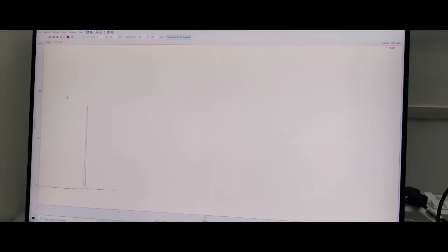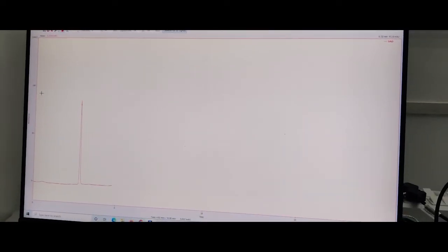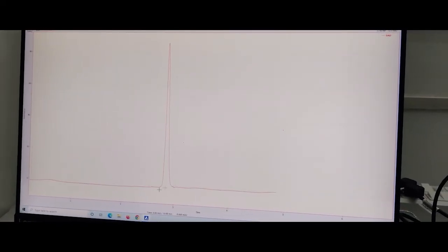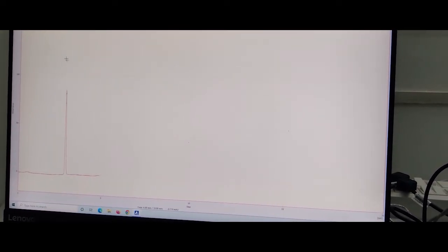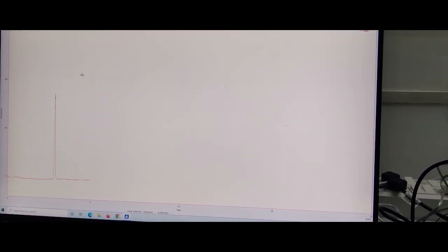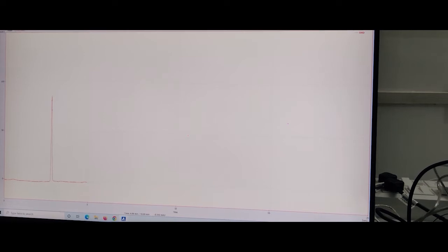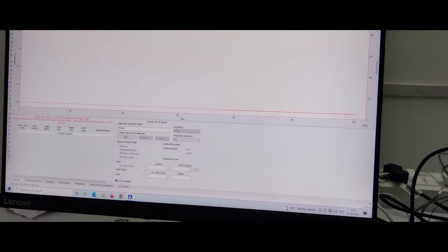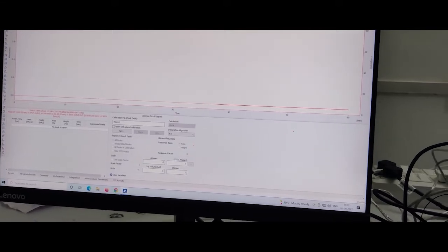The sample is running. Peak has already come, but please wait for the time to complete the run. Now run is completed.